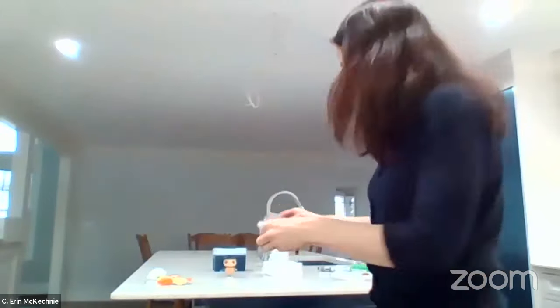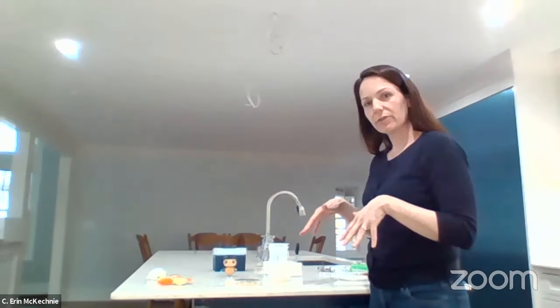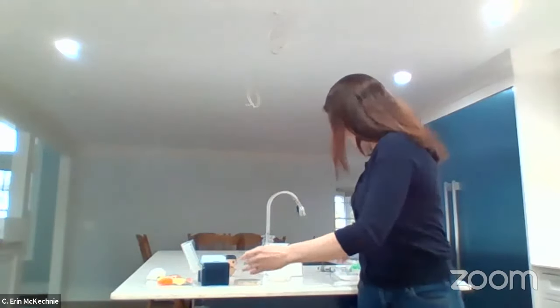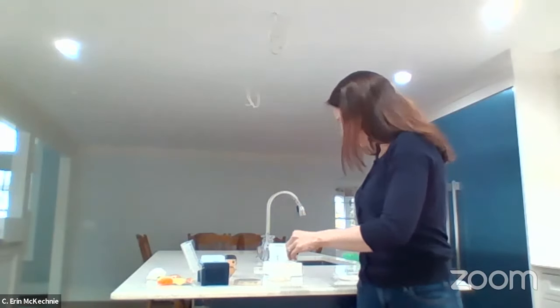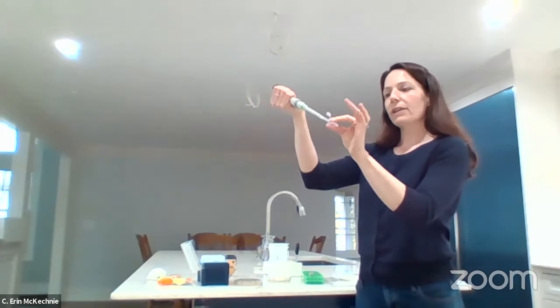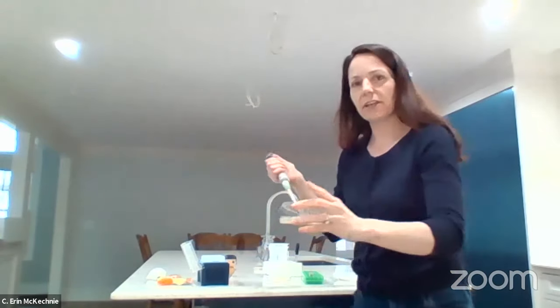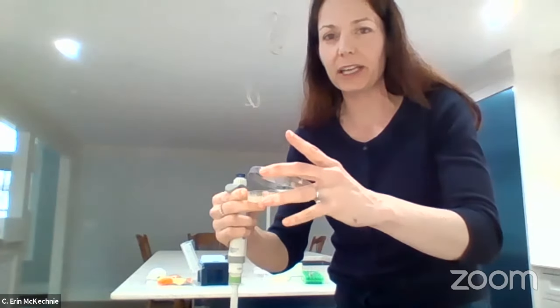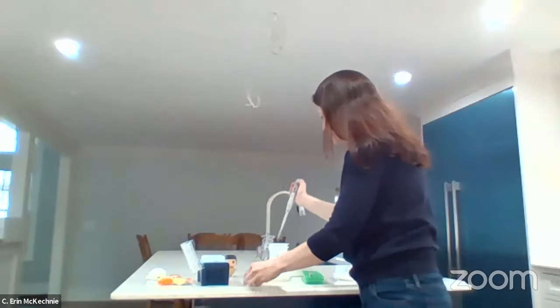All right. Now it's time to add that bacteria that I have and just spread it around the surface of the plate. So we get another tip. And I'll pick up my tube. What happened to my tubes? I'll pick up my tube that is labeled number 1. Drop that liquid. And I'm just going to lift. See, I don't want to open the plate too much because I don't want anything in the air contaminating the plate. I'm just going to open the lid a little bit, release the liquid anywhere on the plate, and close.